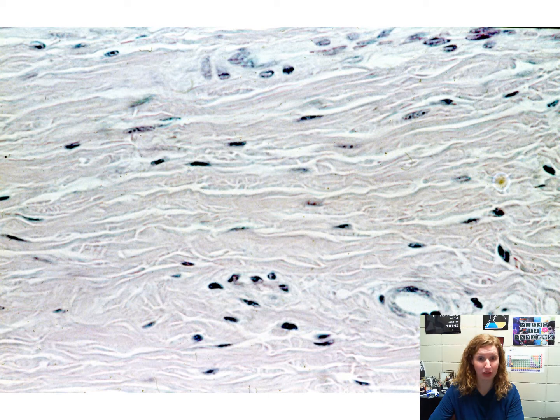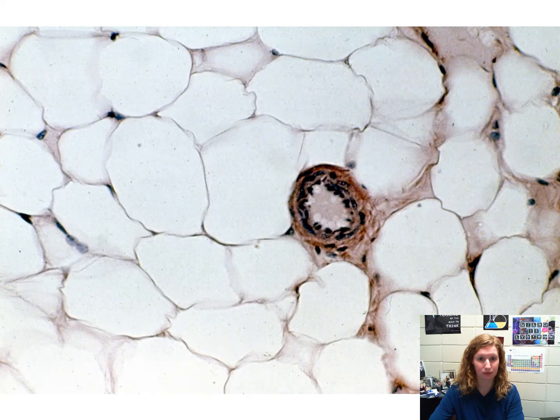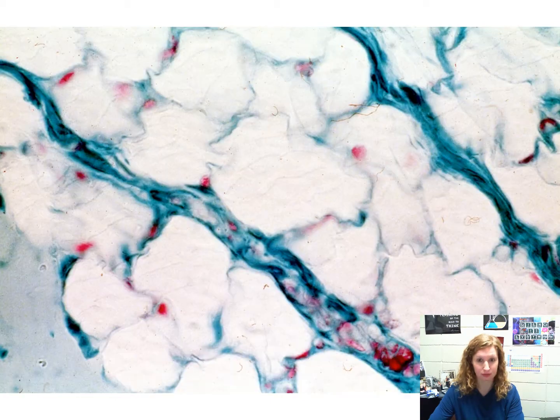Dense irregular connective tissue, dense regular connective tissue, reticular connective tissue, adipose tissue.